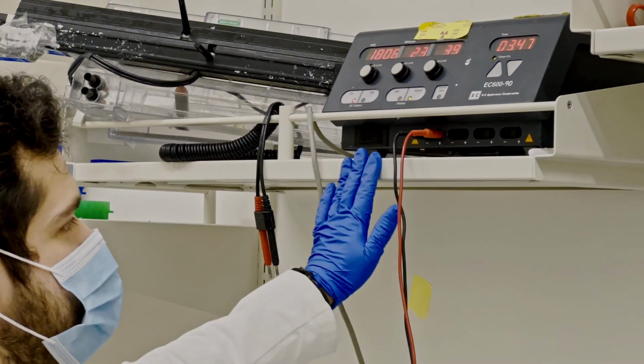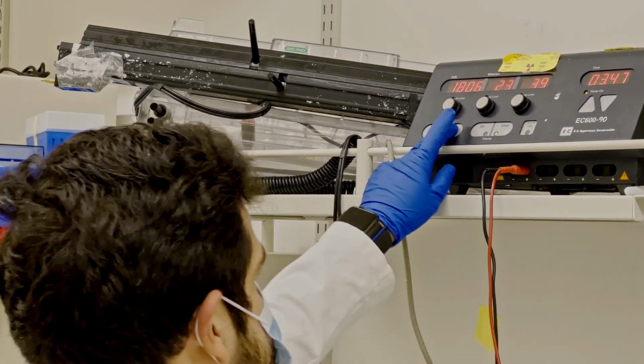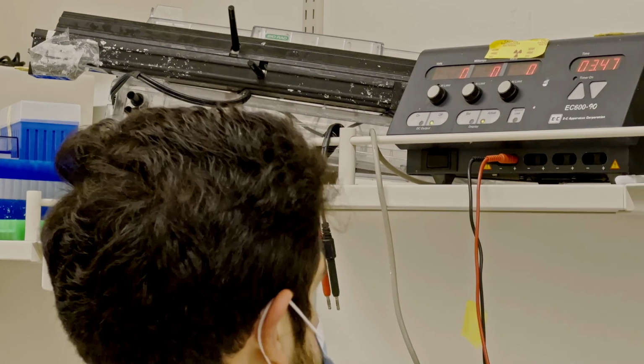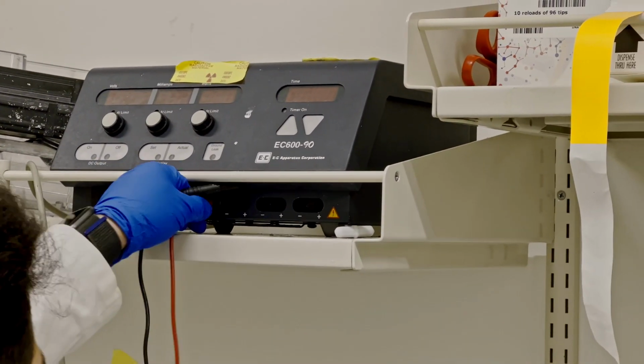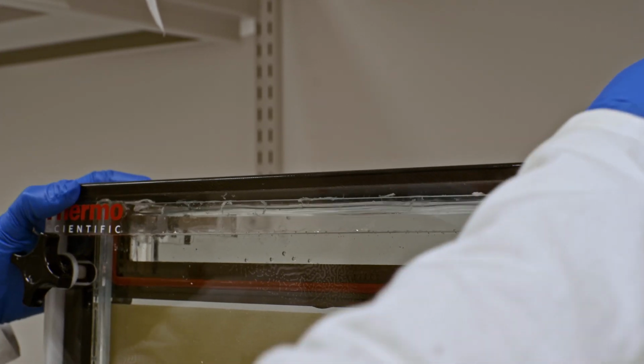So while your samples are warming up, we have to clean the wells. First, turn off the power generator by pressing the off button. Next, turn it off completely and get the anode and the cathode out of the box. So now we're going to open the gel box apparatus, slide it over to the left and pop it up.